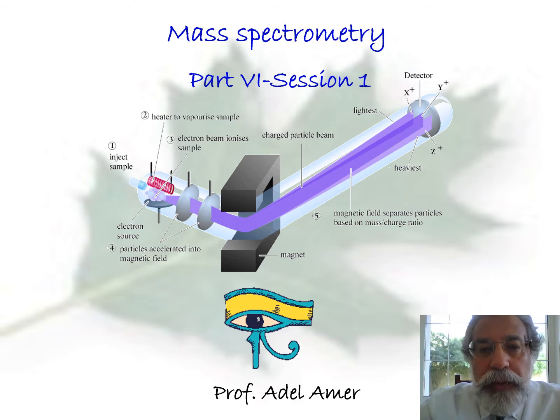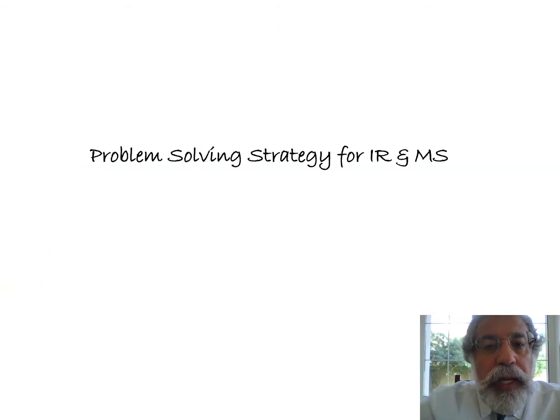Today I am going to talk about problem solving strategy for IR and mass spec combined spectra. Session 1.